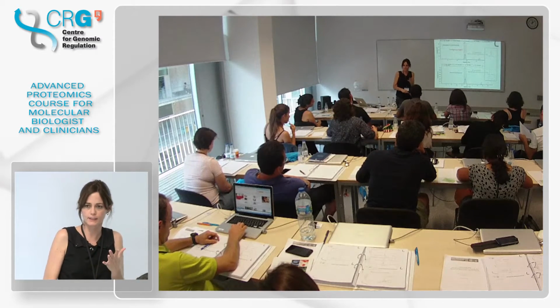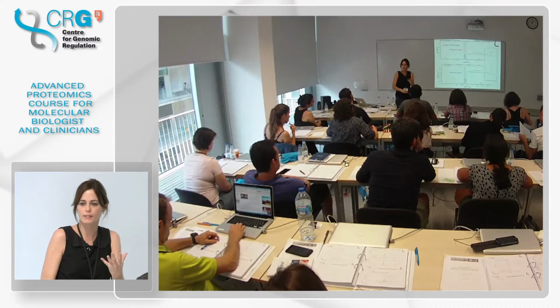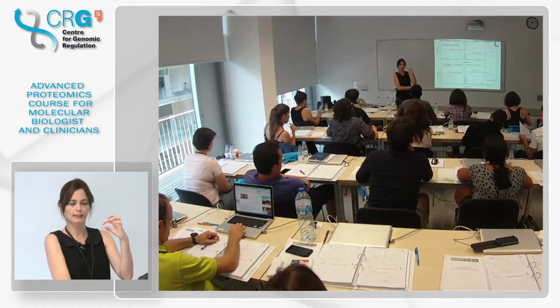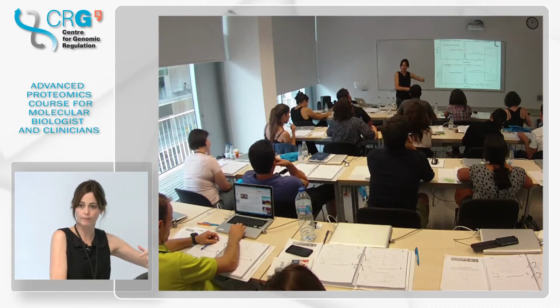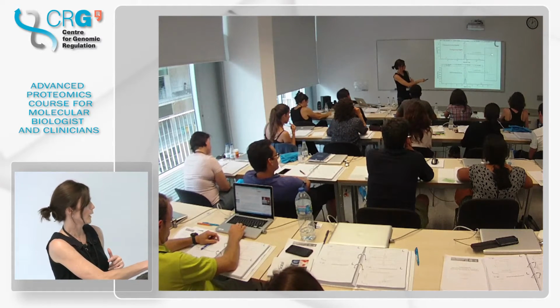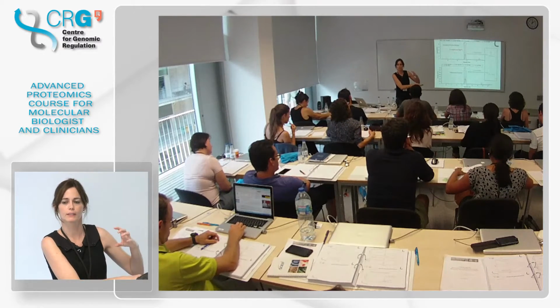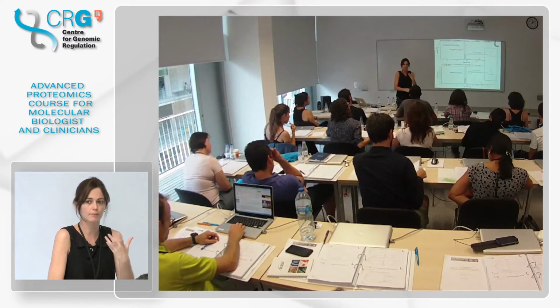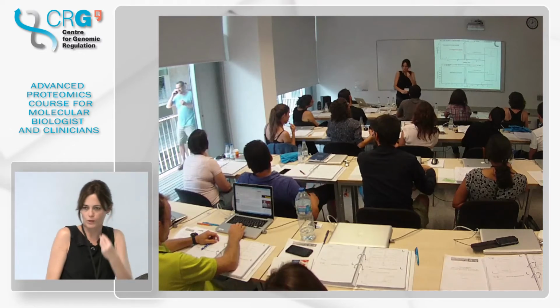But once you have seen this, maybe all you want to know is what is the total signal of my peptide. And then what Skyline does is adds up these signals into one. The intensity. Yes, into one like this. When you are looking at this is the addition of all of the transitions that were monitored. It's different ways of looking at the same data. Some help you more depending what in that moment you are looking at.